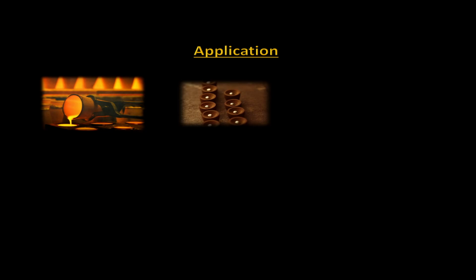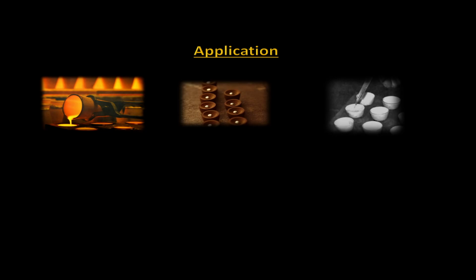As an application, in regards to this first example, in fire assay, the sample is combined with a flux material, it is melted, then cooled, the resulting bead is then cupelled and parted. That bead, usually gold, would be placed into a parting cup with nitric acid added to remove any alloyed silver that may be present.